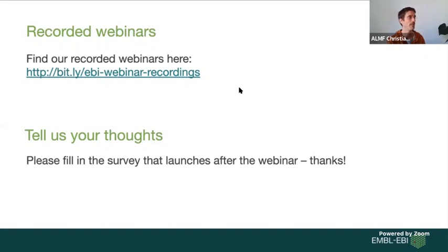Then you have two binary images. And then indeed, if you do an AND operation, you would get all the pixels that you have segmented in both. And then you can, for example, divide the number of pixels in the AND operated image by one of the two others. That's actually one way how you could measure colocalization, yes. So that's one of the most standard ways indeed.